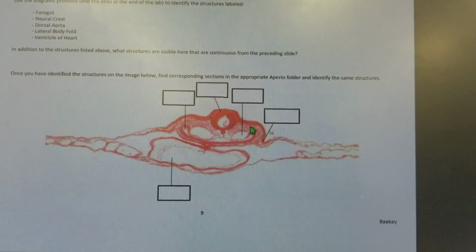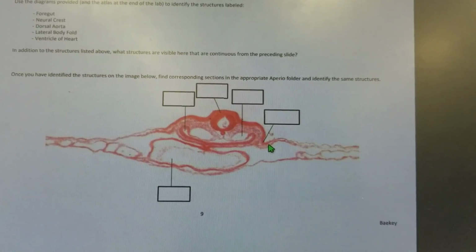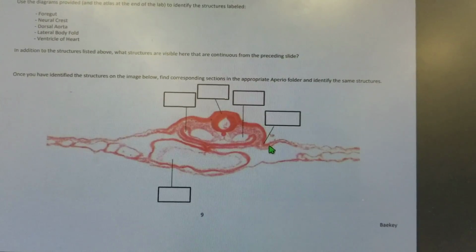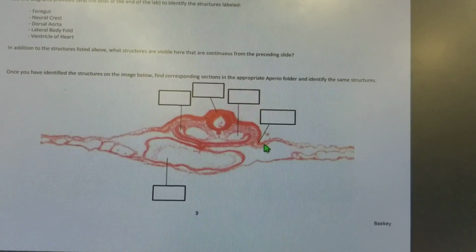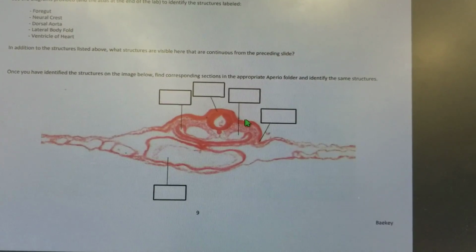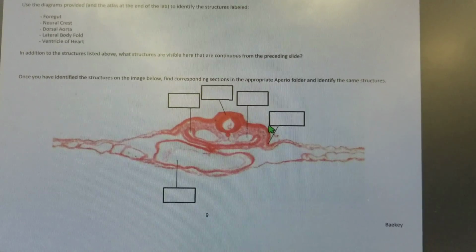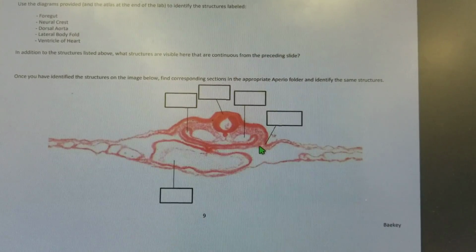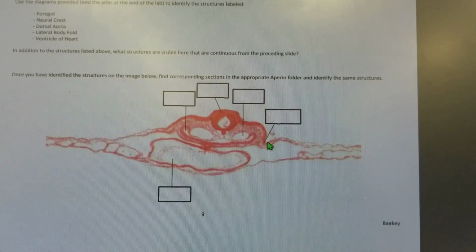Okay? As the body forms, remember this is a chick. So it is forming from a blastodisc where there's been a primitive streak, and the cells have, from the epiblast, moved through that primitive streak and formed these three germ layers, right? So this is flattened somewhat. And the edges are going to start curling in. And those become the lateral body folds. This one right here, as it comes in, they become the lateral walls of the body. Okay?